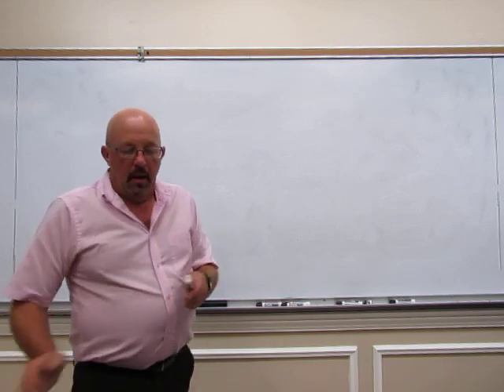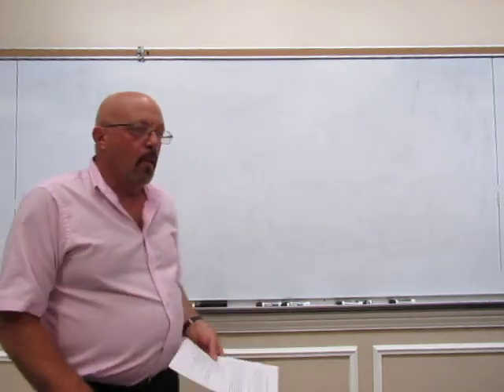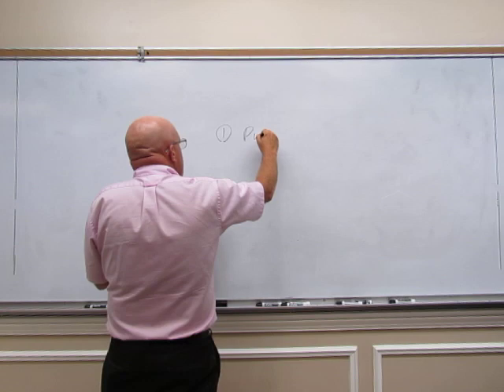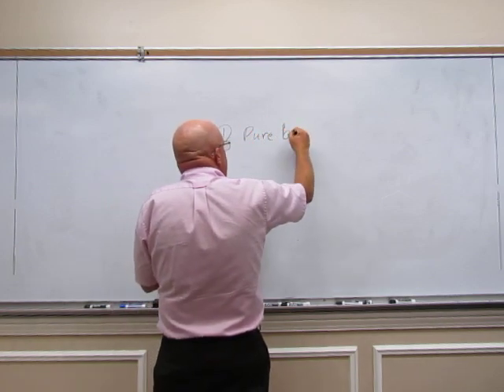So this week, though, I do want you to do a couple melting points so that we have something to compare with. I want you to do a melting point on pure benzoic acid. And we have some pure benzoic acid already sitting out.